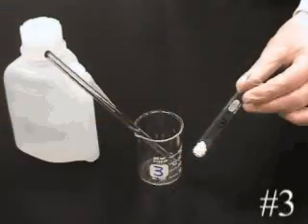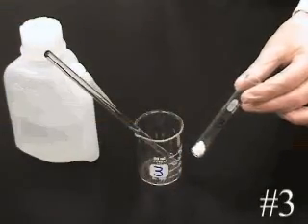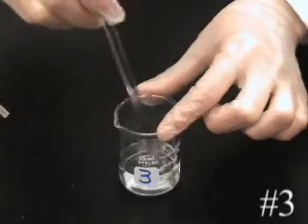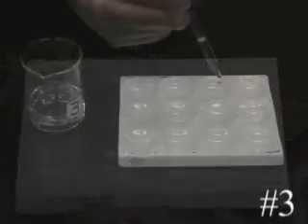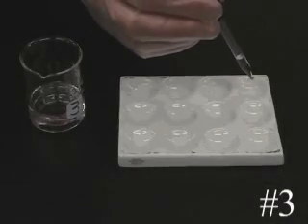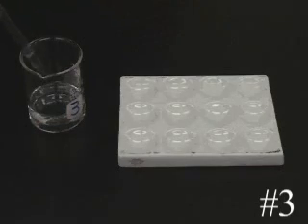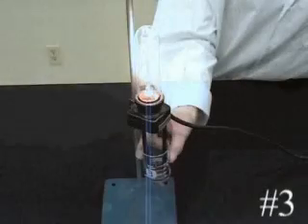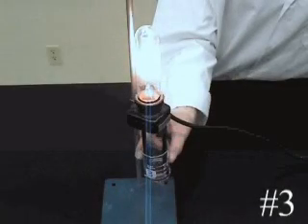We will now repeat the process for solid number 3. Record your observations. Record your observations.